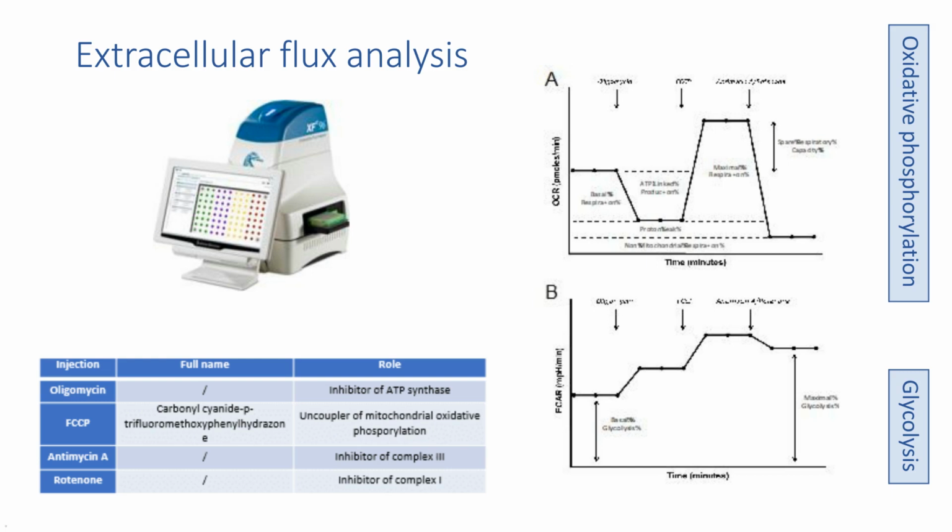And we can inject these in different sequences, and then we can measure what's called the oxygen consumption rate, up on the top right there of the slide, or we can measure the extracellular acidification rate, which is in the bottom right there of the slide. And the oxygen consumption rate, which we use the shorthand of OCR, allows us all kinds of measures of oxidative phosphorylation.